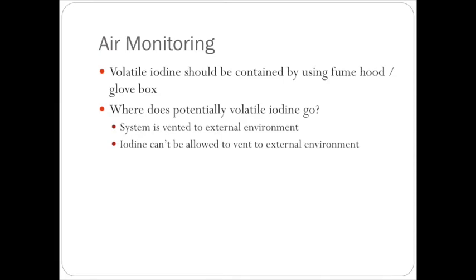So basically we will use the charcoal filters to try to trap as much of the iodine as we possibly can, and then the hopefully clean air is going to vent out into the outside environment. Now, while charcoal is a great trapping material, it has limitations. The limitation is that once it binds iodine, there are a limited number of binding sites where it can actually grab on and hold on to the iodine. So if you keep passing this stuff through the charcoal filters, eventually the charcoal filters are going to get full, and if you can't stop it, the iodine goes farther and farther.